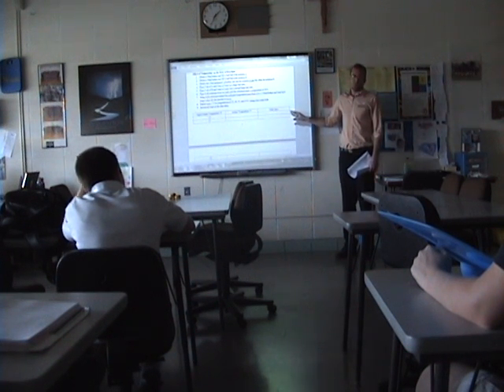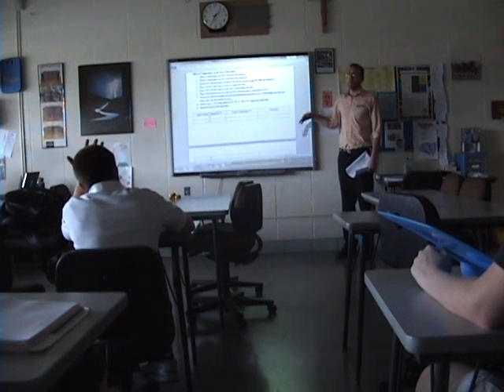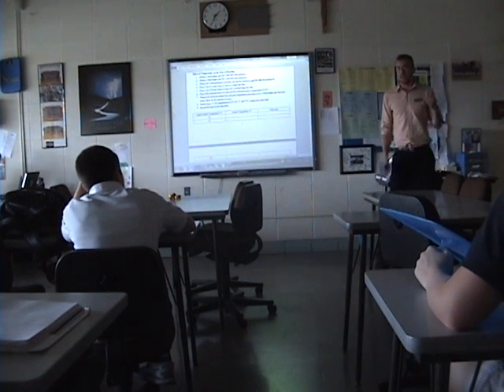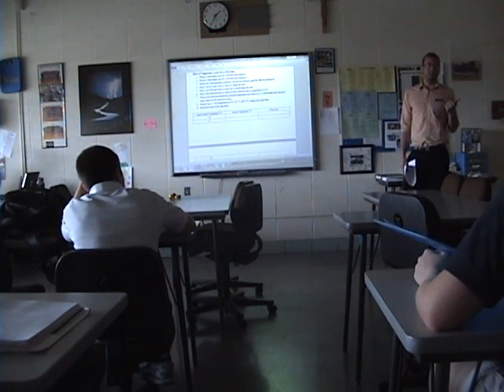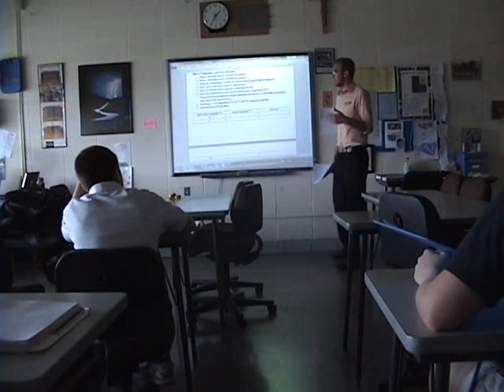After this first one, it's going to be really cold, so how long do you think it's going to take? Long. It's going to be a while, so it's going to be more than a couple minutes. Just so you know, it's going to take a while. The last group tried to count in their head for it, and they were sorely mistaken on that first one. So you've got to use your phone or something. You can't just count in your head.